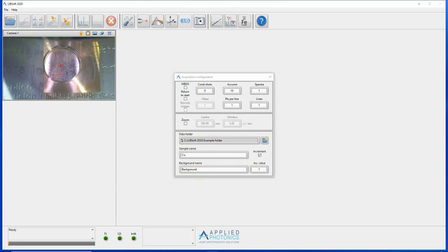It is also possible to initiate the acquisition of a new background spectrum manually using the appropriate shortcut button in the main screen toolbar. So this one here. So if we do that now, if a background spectrum is acquired manually, the user is warned if a background spectrum with the same name already exists, and is given the choice as to whether to overwrite it or just cancel the acquisition. In this case, we will overwrite the background spectrum.